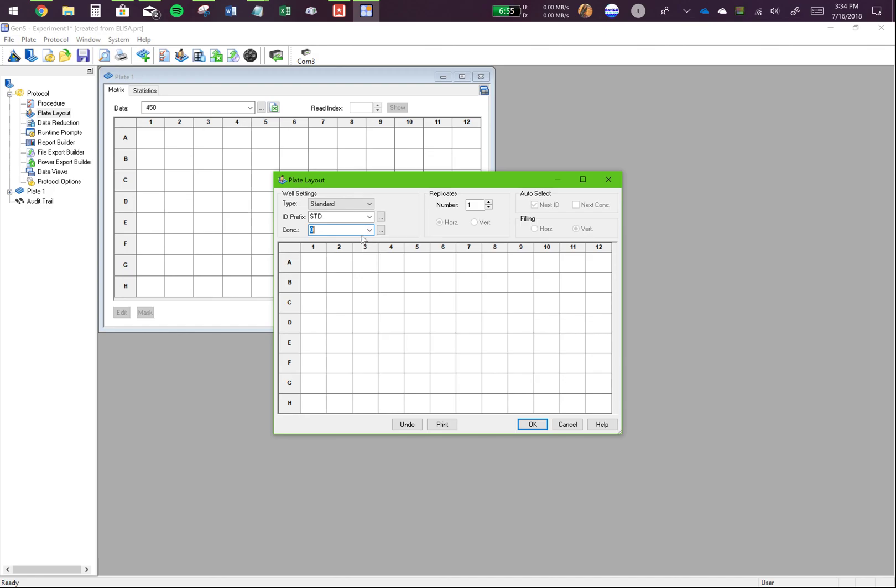So that's why for the standards, the values should be known, so that you can interpolate unknown samples. So you click on standard here. Click on these three dots.